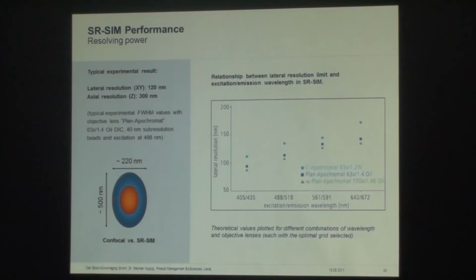Based on this resolution you could also use a 561 and 642 to keep them pretty close to each other. But the difference in grid spacing between here and here is too high compared to between here and here.